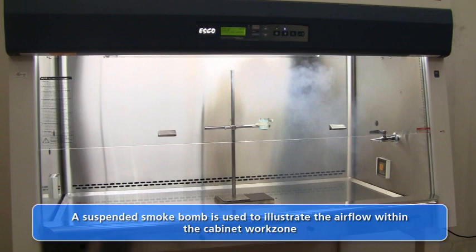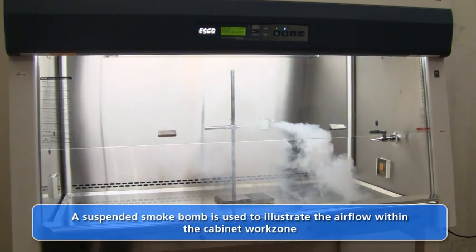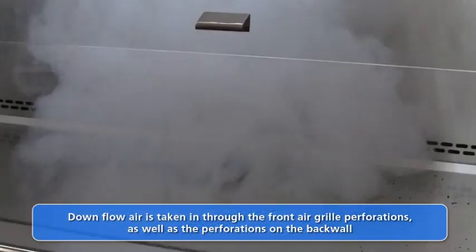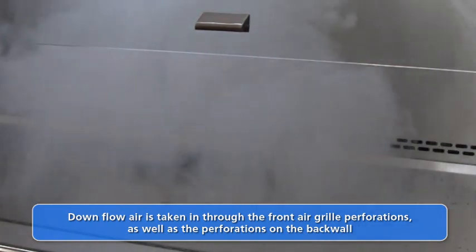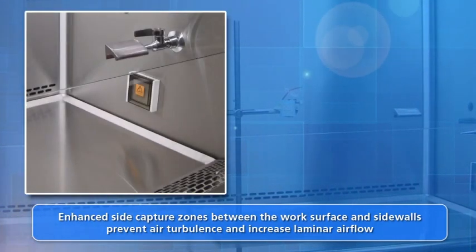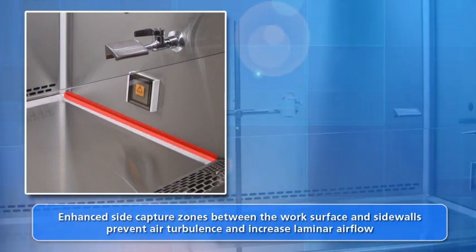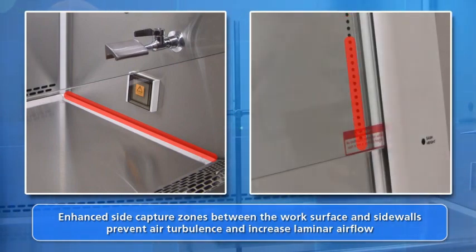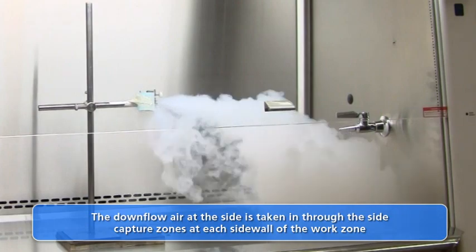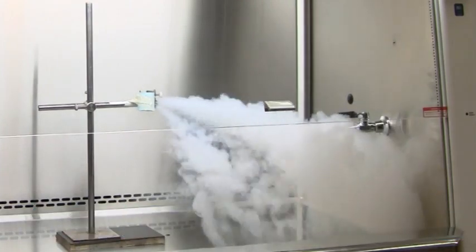The following experiment with a smoke generator illustrates the airflow pattern in a Class II Type A2 cabinet. The downflow air stream splits and is taken in through the back wall perforations and the front air grill, ensuring the airflow stream remains unidirectional and free of turbulence. The enhanced side capture zone between the side walls and the work surface eliminates the possibility of downflow air bouncing off the work tray and creating turbulence. For additional safety, the LabCulture cabinet side walls are fitted with side perforations behind the sliding sash to remove possible turbulent air pockets from the work zone. A smoke generator placed near the side walls illustrates the airflow into the enhanced side capture zone and the side wall perforations.